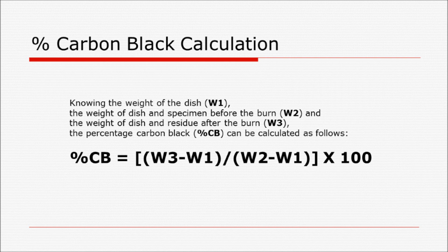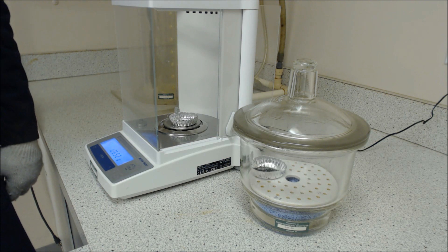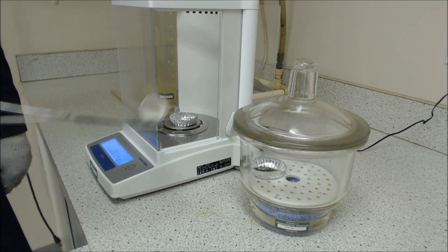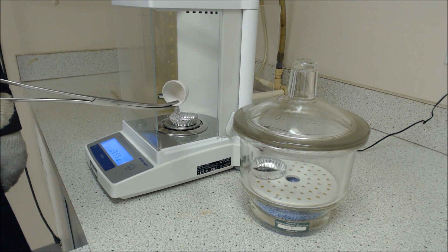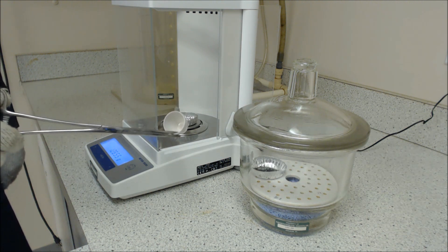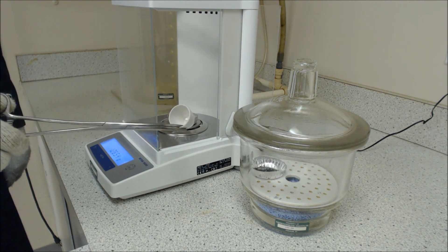I should point out that not everybody uses aluminum pans. Sometimes they use crucibles. We prefer the aluminum pans. They're disposable. The crucibles are obviously reusable.